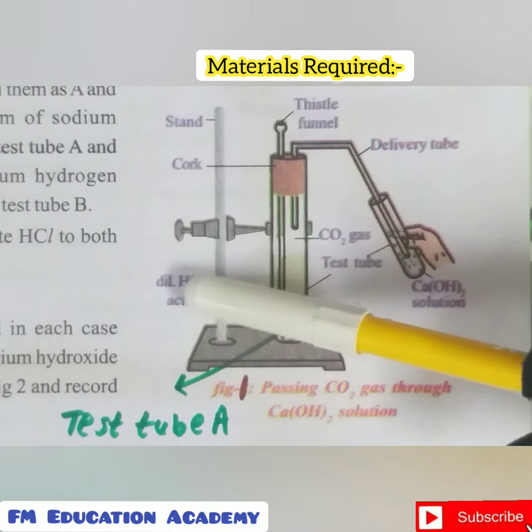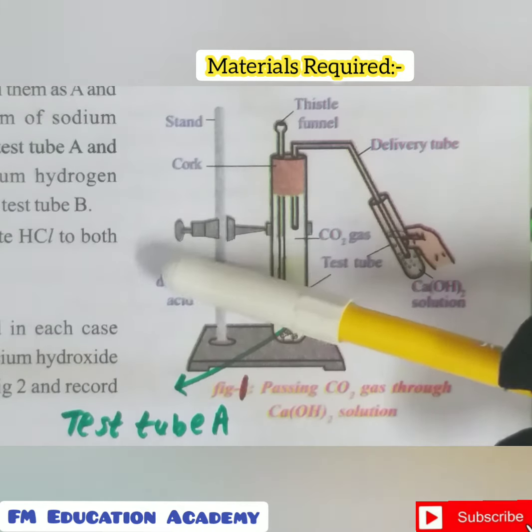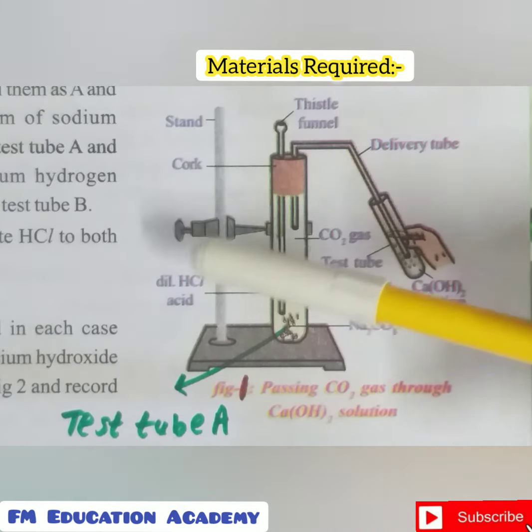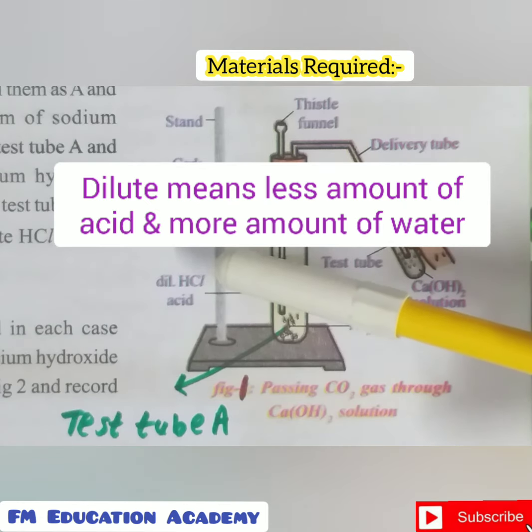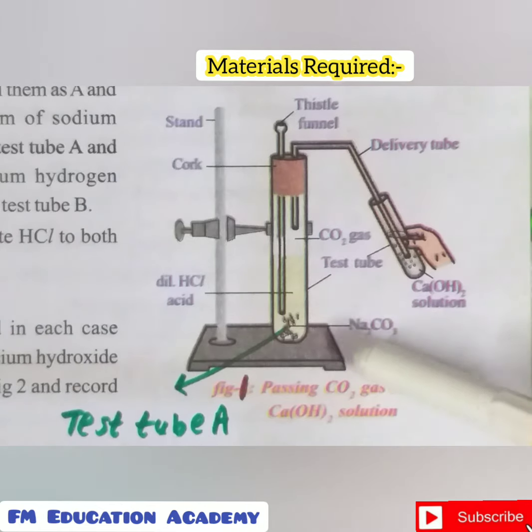That is, we have to test an acid, right? Which acid are we using here? Dilute HCl. Dilute HCl means dilute hydrochloric acid. What do we mean by dilute? Dilute means less amount of acid and more amount of water. And we also need sodium carbonate, Na2CO3 is the chemical formula of sodium carbonate.